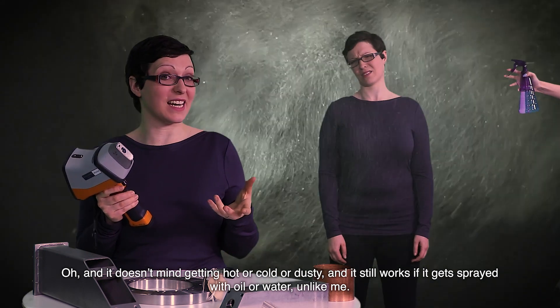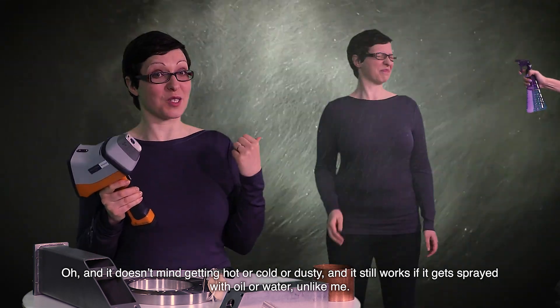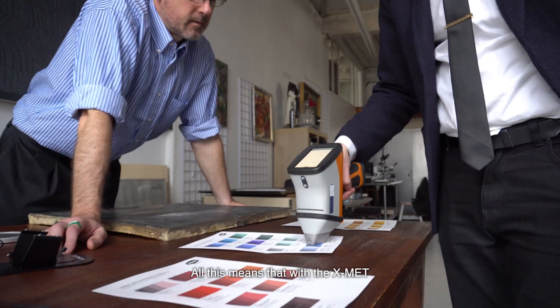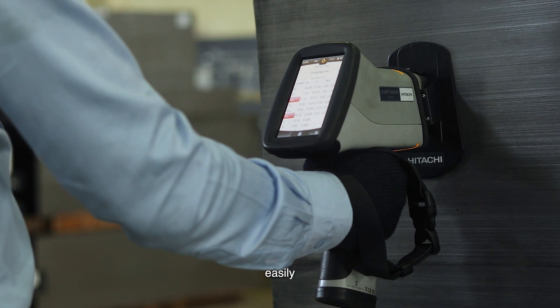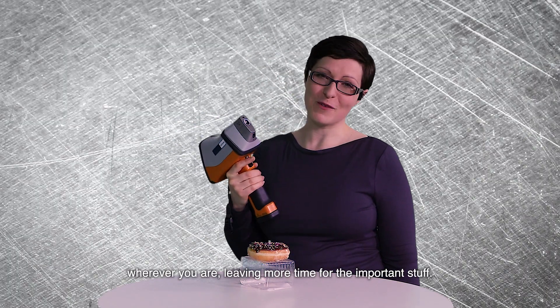And it doesn't mind getting hot or cold or dusty. And it still works if it gets sprayed with oil or water. Unlike me. All this means that with the X-Met, you can get your job done quickly, easily and accurately, wherever you are, leaving more time for the important stuff.